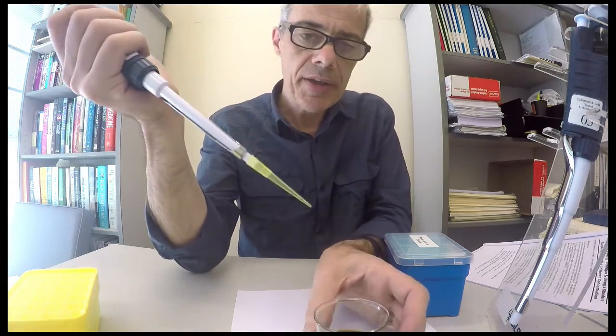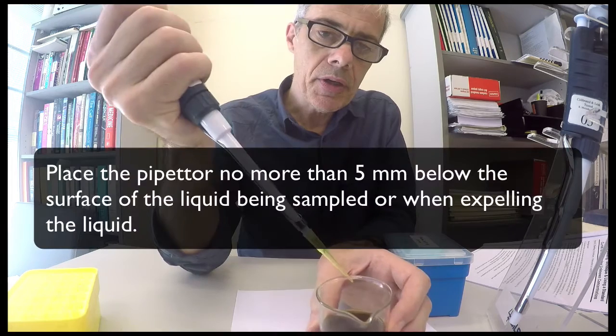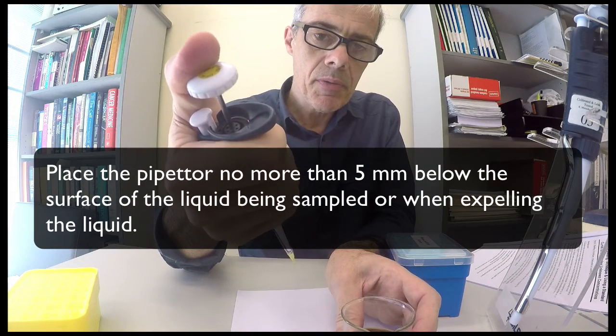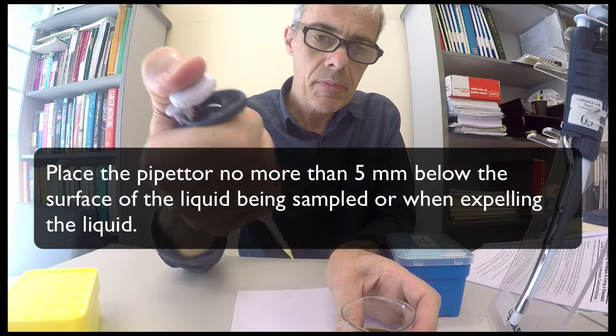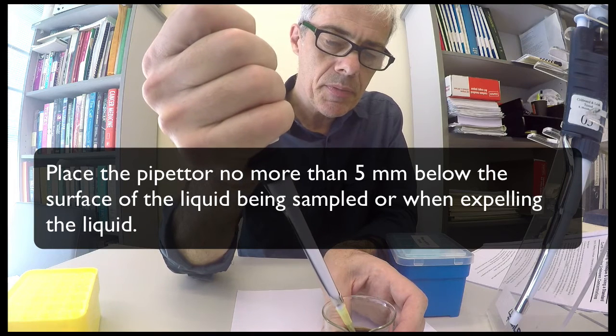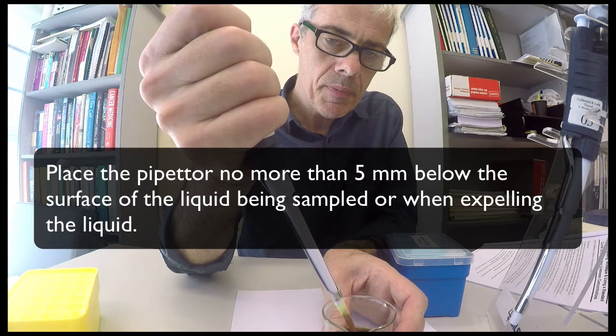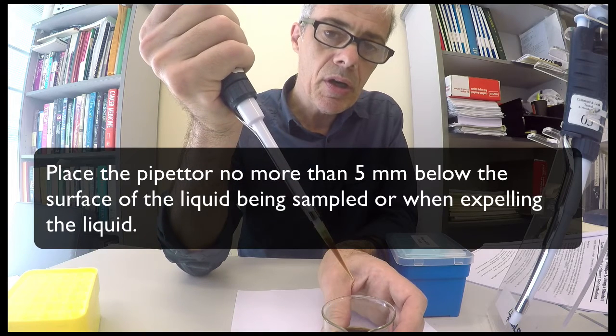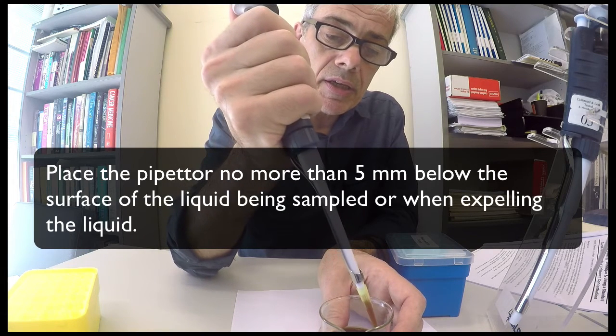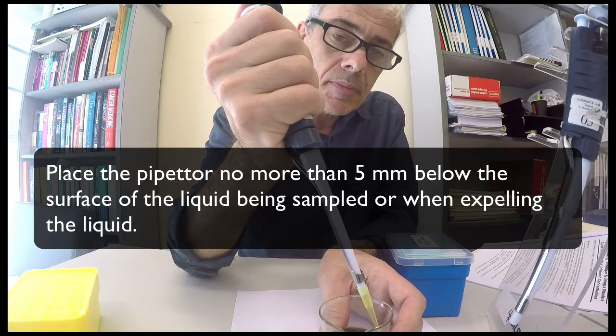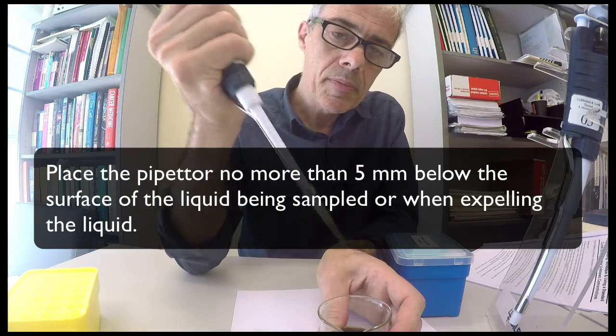So to summarize, to draw up solution you go down to the first stop, you immerse the tip, you draw it up slowly, and there's your 200 or 180 microliters, and then you can dispense the solution.